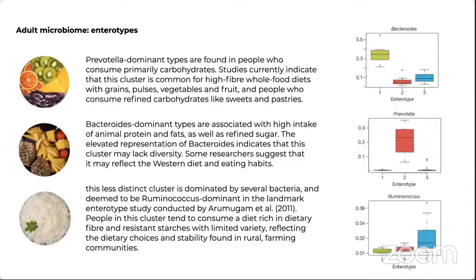So basically, in summary, what we want to do is have a microbial quantification for the samples under at least two different conditions, right? One condition could be an unhealthy state of the organism, and the other condition could be a healthy state or control organism. This doesn't have to stop at exploring the health issues of humans. This can extend to, for example, the suitability of soil samples for plant growth. This can extend to soil quantification and characterization in general, right? And several applications of this are actually done, etc.